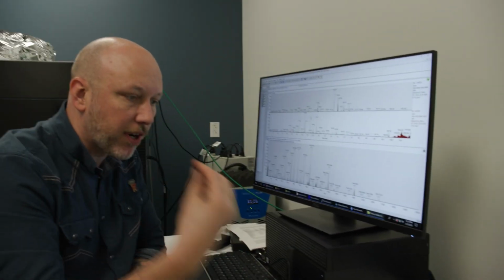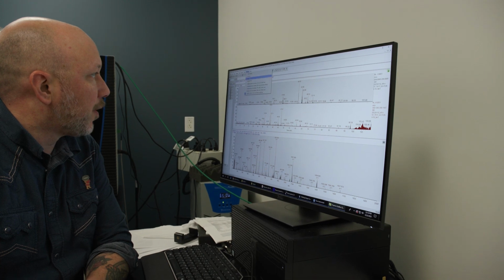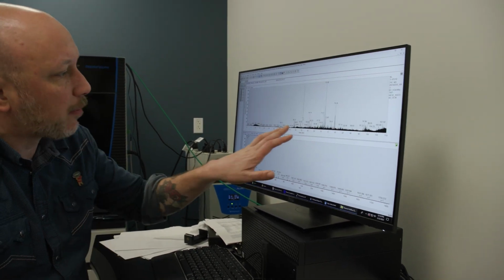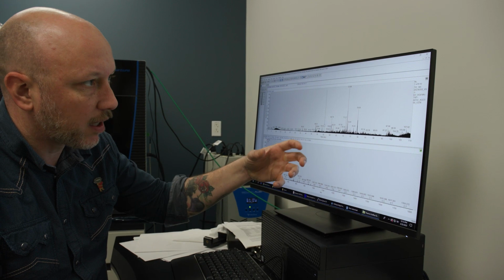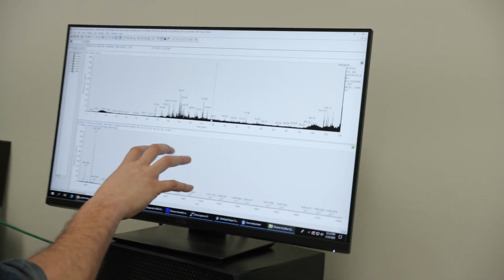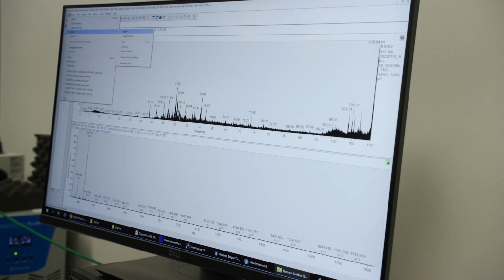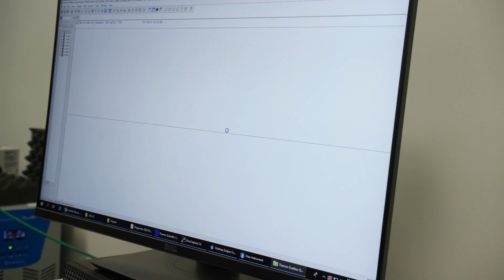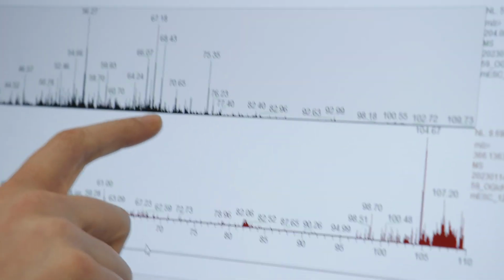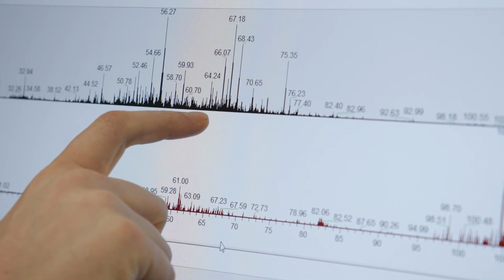But if we turn to a sample in which we've taken steps to enrich for these glycopeptides, out of the milieu of all these unmodified peptides, then we can ask, how much of our ion current has a diagnostic ion for a glycopeptide? When we look for glycosylation ions in a sample that we enriched for glycopeptides, in contrast to seeing very little in our diagnostic peak, now we see a lot of signal, right? So this is how we know we've enriched for glycopeptides really well, okay?